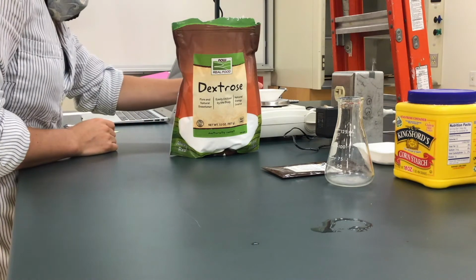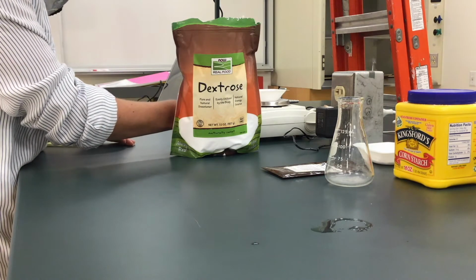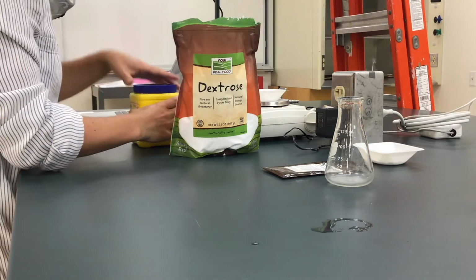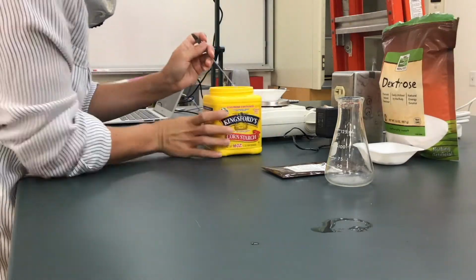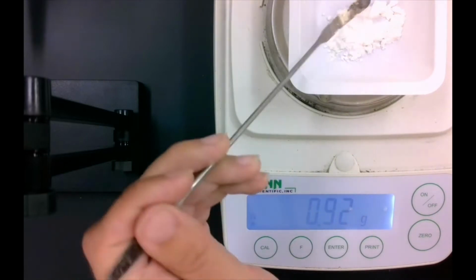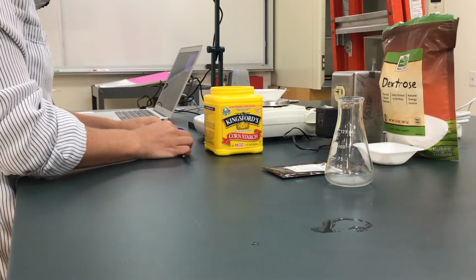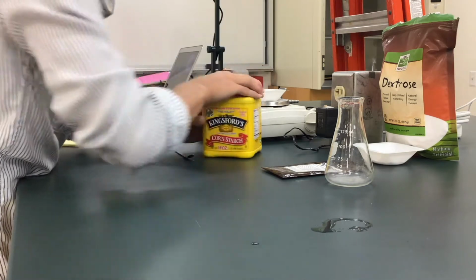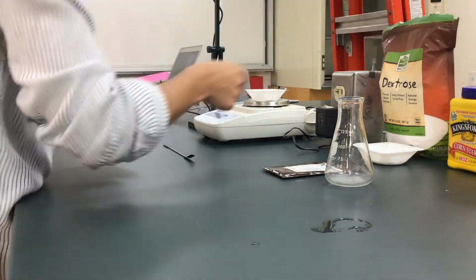Next, I'm going to measure out our cornstarch. And we need a much smaller volume, or much smaller mass of cornstarch in our solution. There, perfect. So that's about how much starch we're going to need in the solution. So I'm going to set that aside.